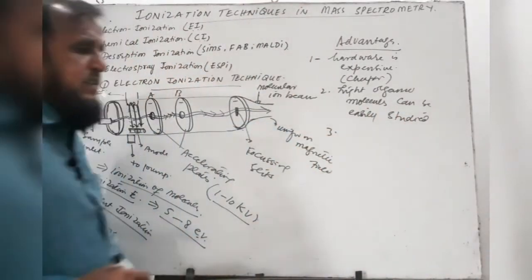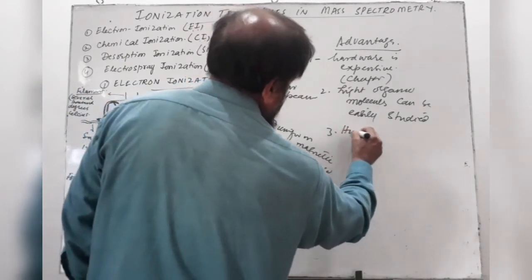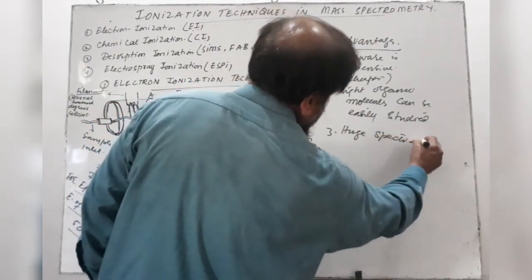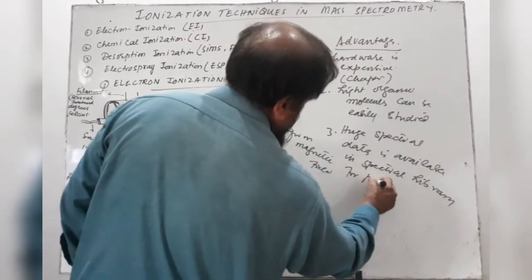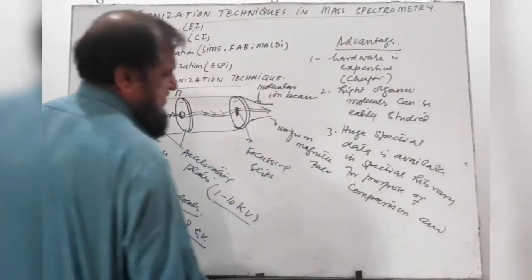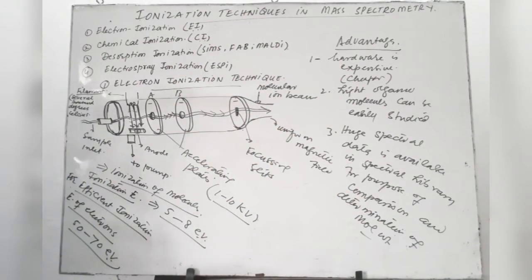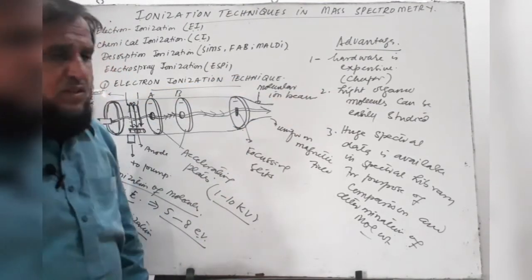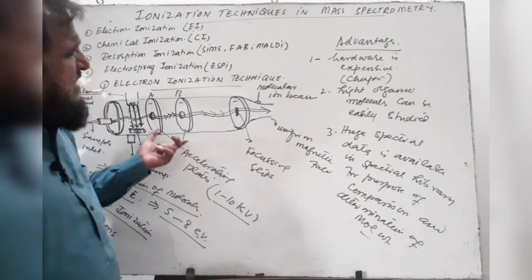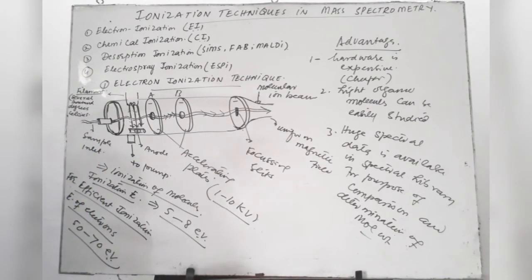And number three, a huge amount of spectral data is available in spectral libraries for the purpose of comparison and determination of molecular weight.